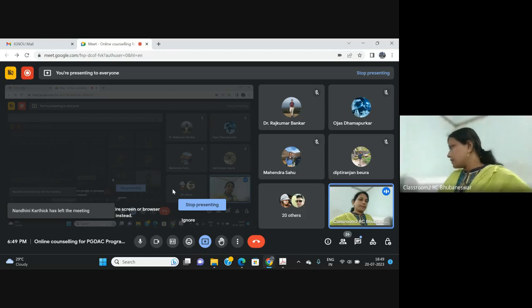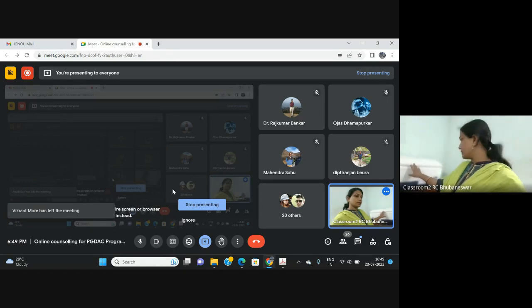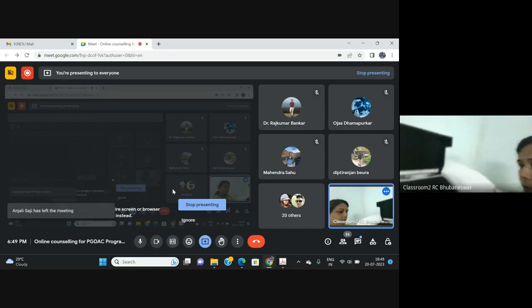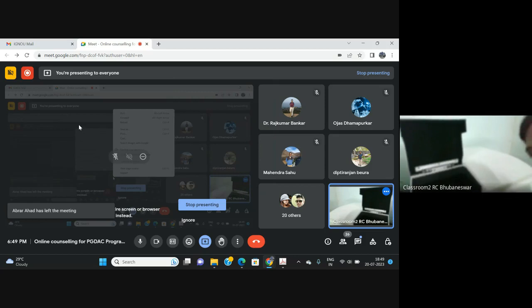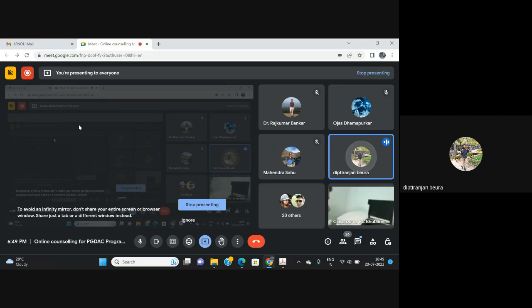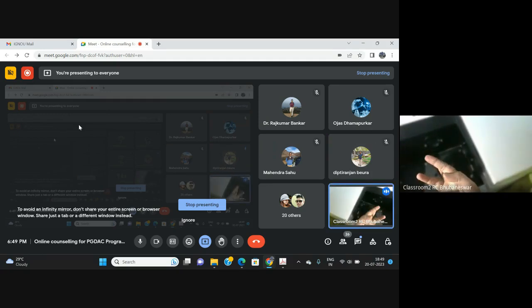Okay, so see, this is your fluorescence instrument. Here you can see, this is the sample compartment. Are you able to see here? No ma'am, it's very small to see. Can you put your torchlight here? Mobile torch. This sample compartment is there. Okay, this is the sample compartment.